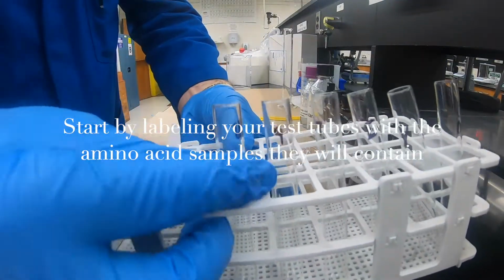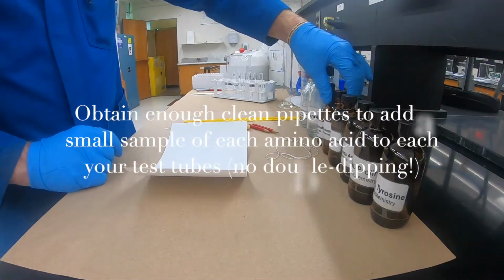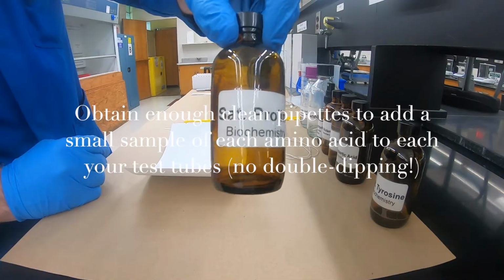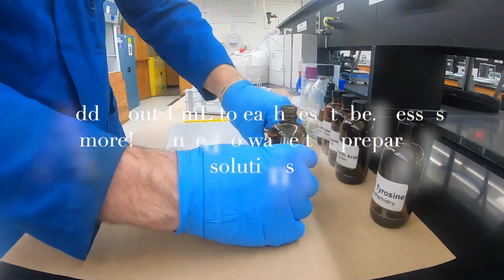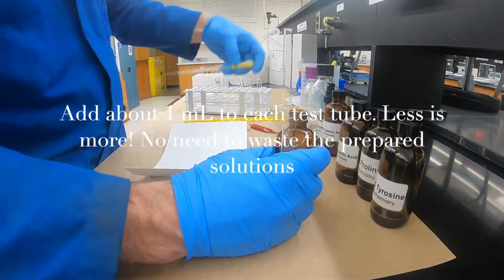Label each of your test tubes with the amino acid sample they will contain. Make sure that you get enough clean pipettes for each amino acid to have its own. Add about 1 milliliter of each amino acid to the test tubes. Less is more, don't use too much.